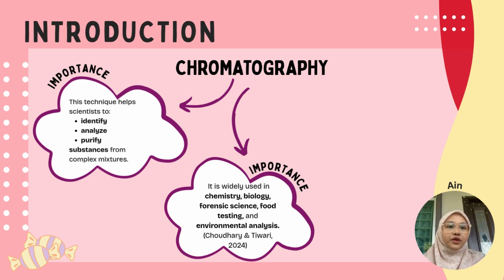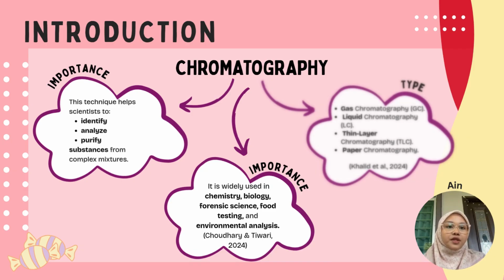There are several types of chromatography, each suited to different applications. The main types include gas chromatography or GC, liquid chromatography or LC, thin layer chromatography or TLC, and paper chromatography. Each method operates on the same basic principle but varies in terms of materials and techniques used.